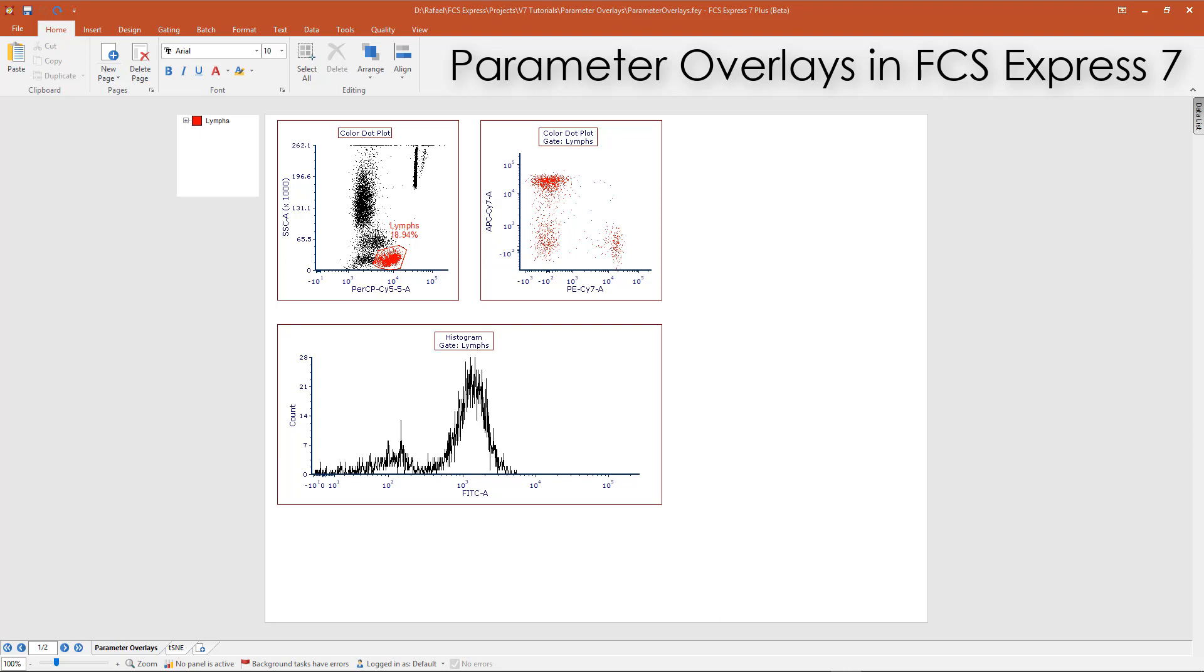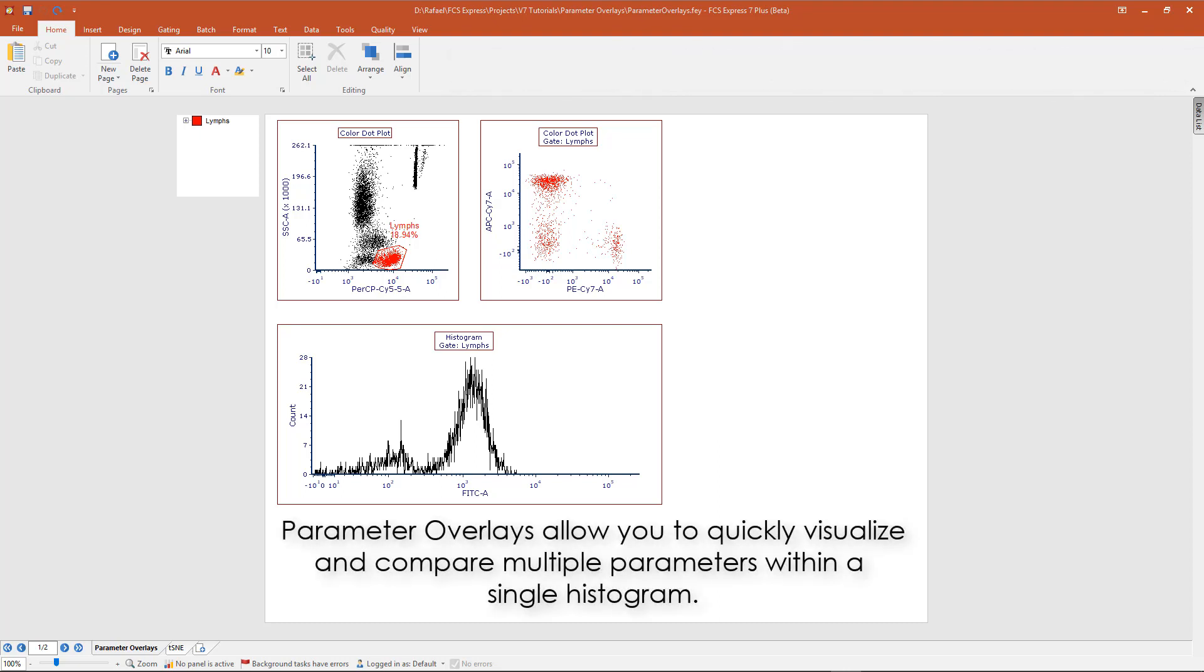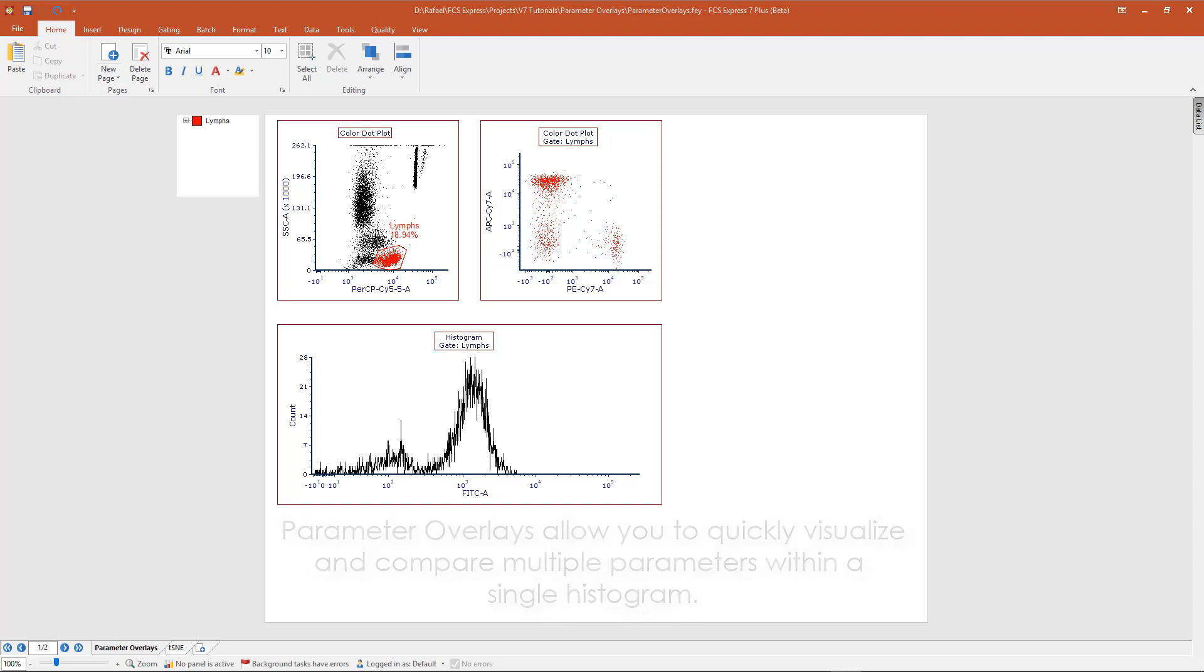Parameter overlays are a new feature in FCS Express 7 that allows for the quick visualization and comparison of multiple parameters within a single histogram.